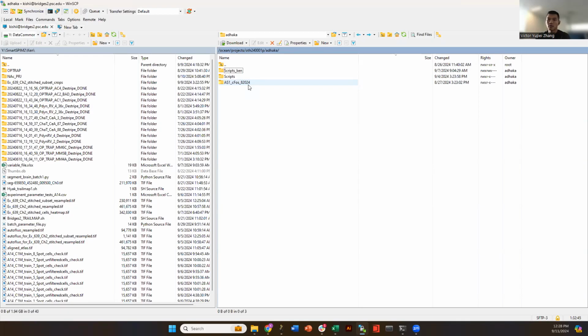I mean, you could also just update the classifier, right? You could bring in the second batch and then just update it with that, so you don't have to redo everything. Making a classifier perform completely differently later on could be challenging because it's so well trained on an existing data set. And if the new data is totally different, it doesn't easily overwrite the previous algorithm. So maybe it will be easier for you to just retrain a new one. That's case by case, depending on how different the two batches are. But I'll keep that in mind. Those are the things I would think about.